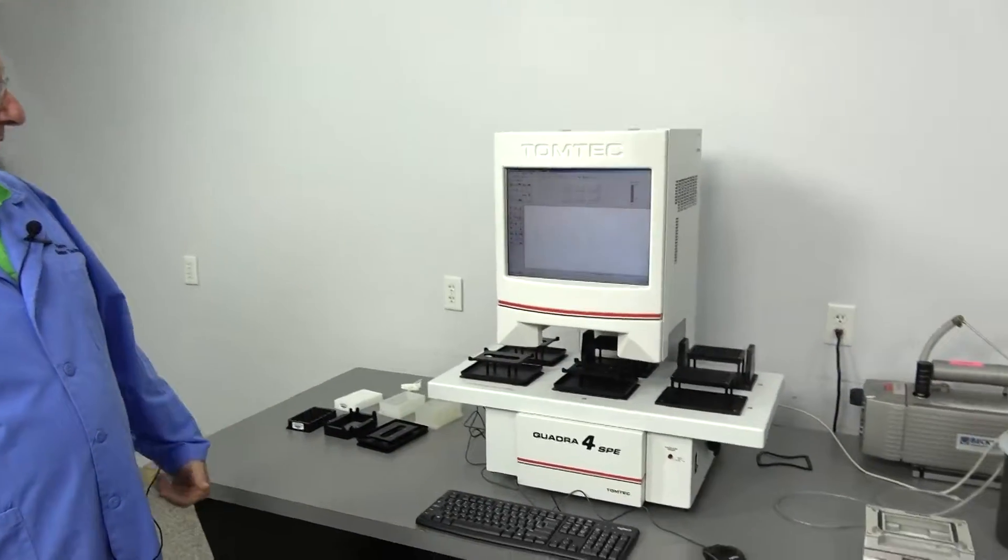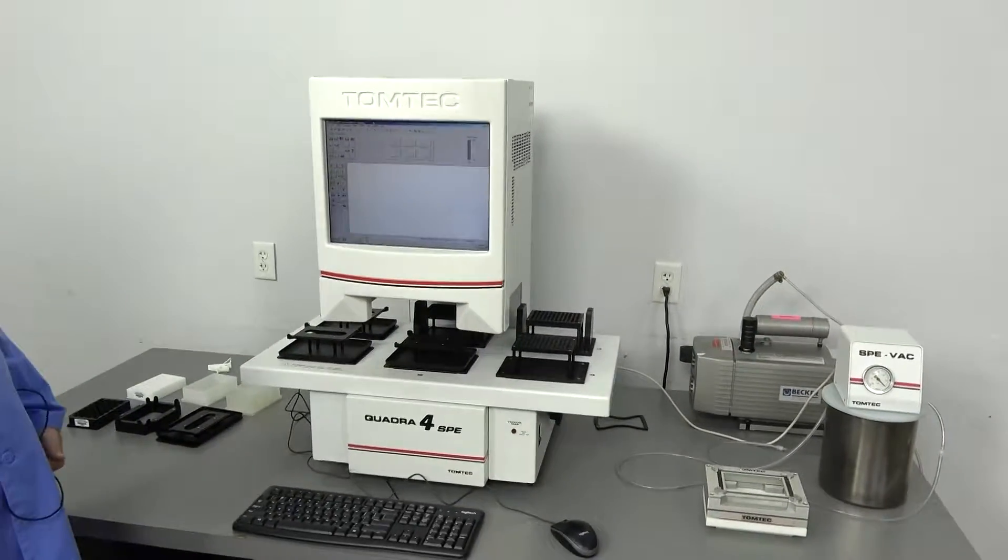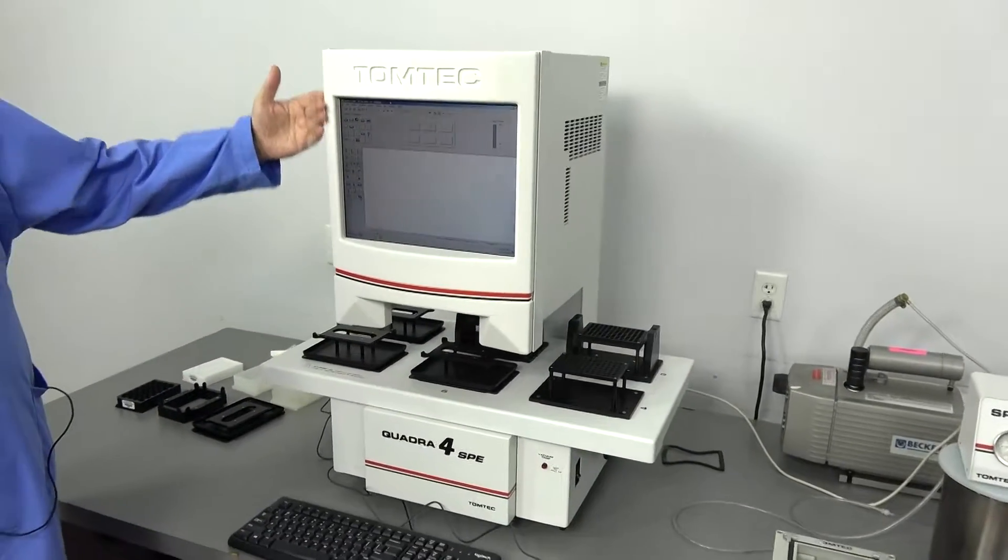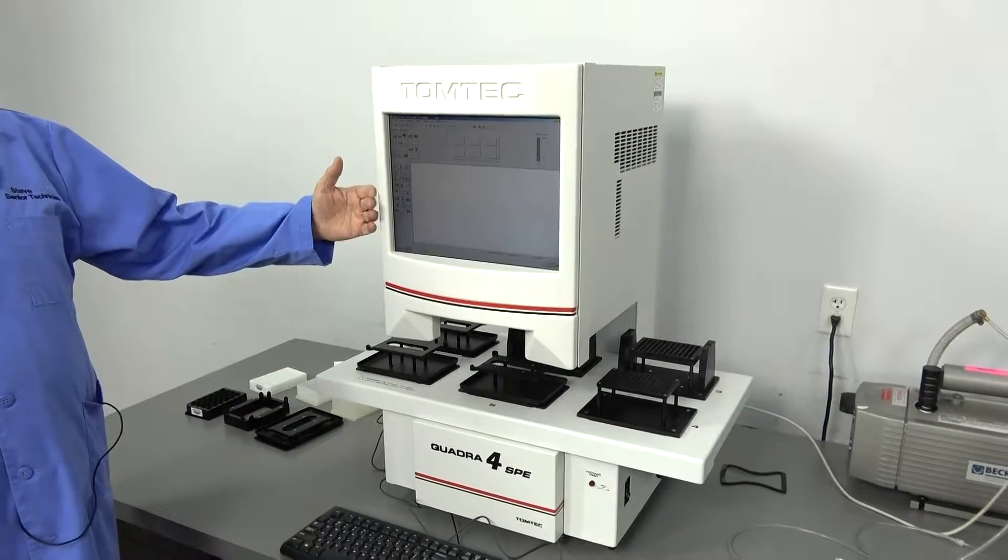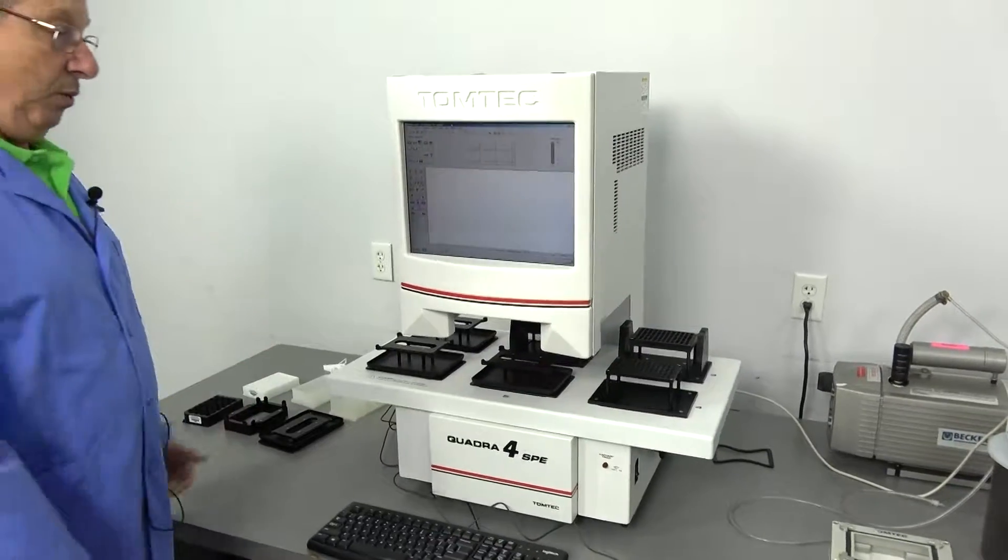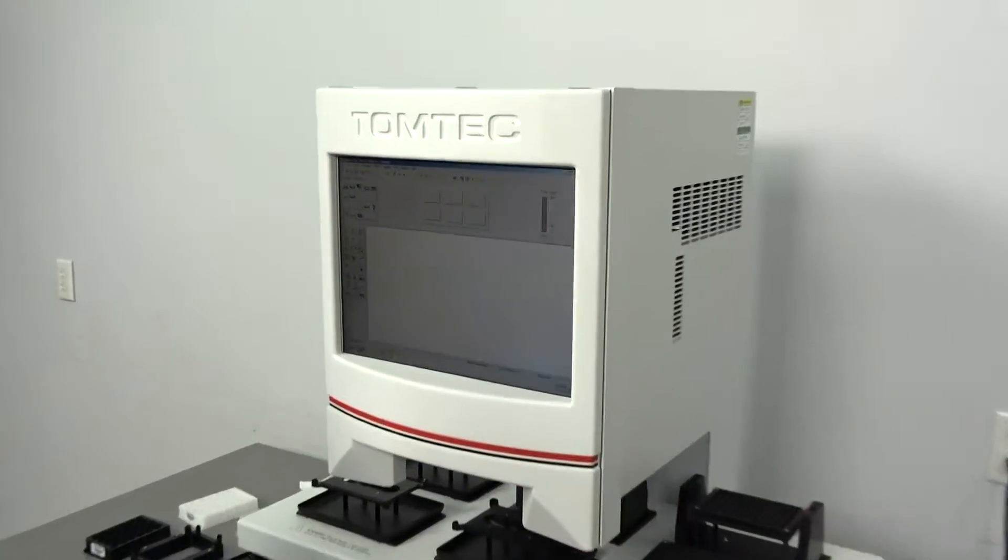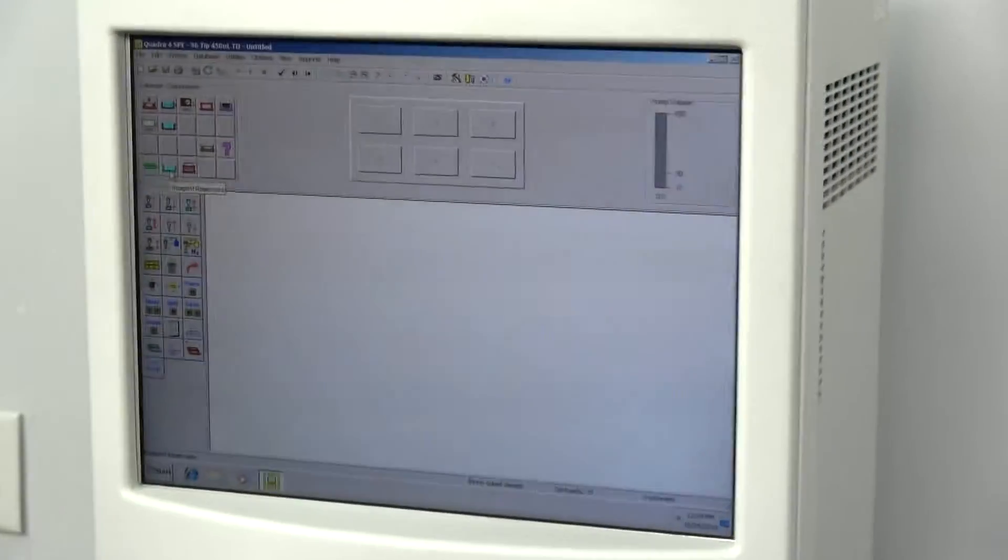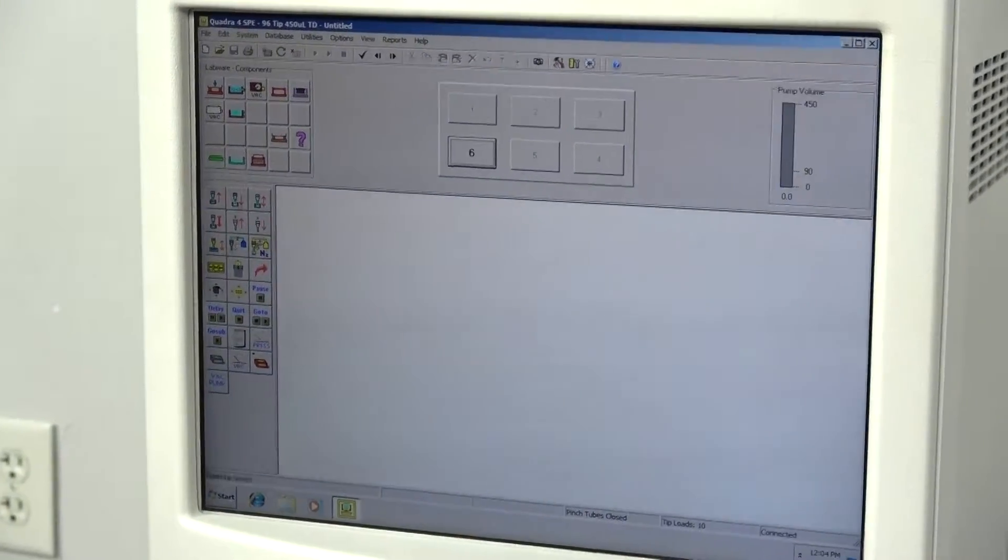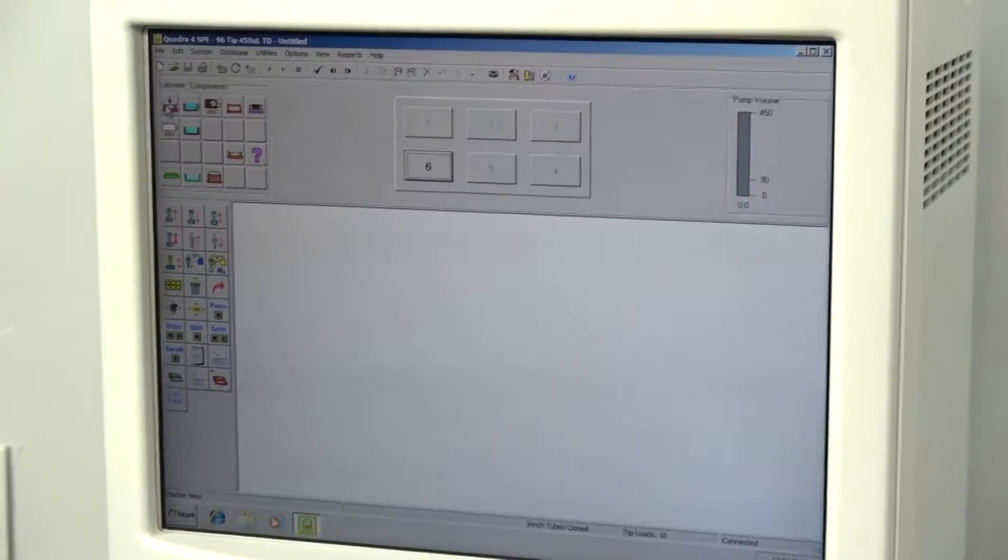Very popular liquid handler, somewhat because of its ease of programming, with a point and click style interface, so that when you want to change the deck wear, you simply point, click, drag to where each item is going to be.